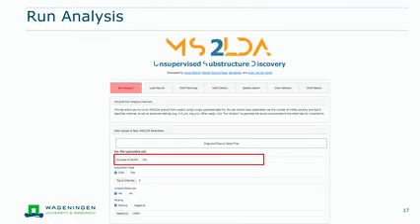Before we do our first exercise, I want to show you what you can do if you have the desktop app running. It's not possible on a server. If you have the desktop visualization app running, you can do your own analysis there, and there's a run analysis tab on the most left side. A really important parameter, as I said, is the number of master motifs, so the estimated substructures. If you have a dataset, think about a number of substructures you would expect and add a bunch of them.